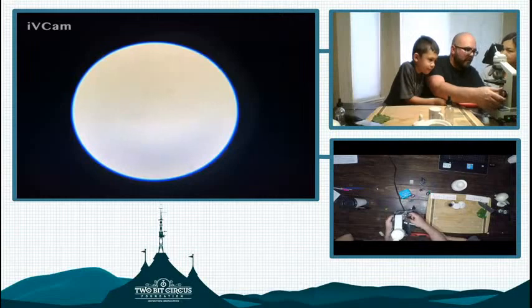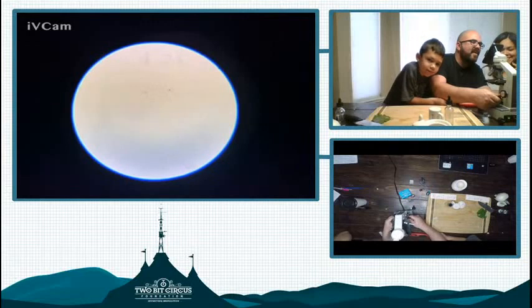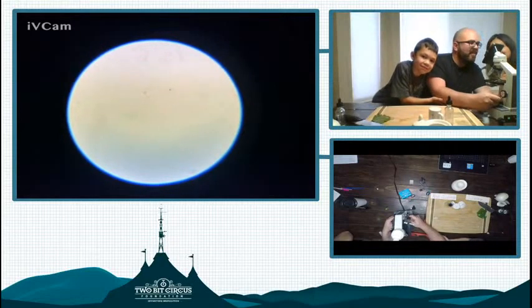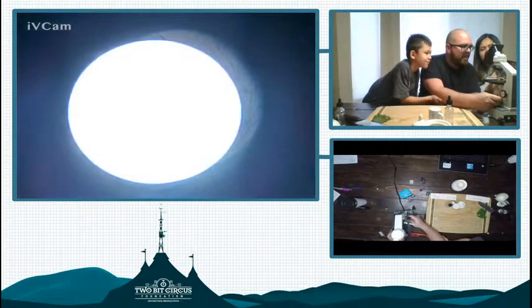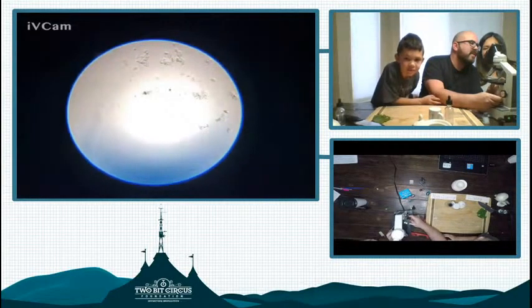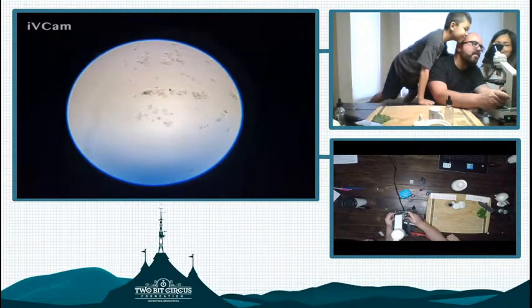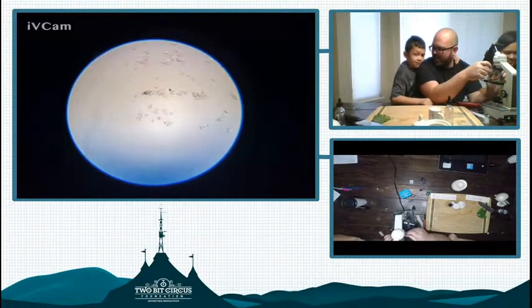You gotta put it way higher. It doesn't go higher. Oh, that's it? That's why. The focus is all out because you're messing with the fine focus. Alright, so I'm starting to be able to see the structure of some stuff, but it is still hard to tell what it is. Maybe less light through here? Oh, there we go. Look. Are those cells? So I see yucky stuff that came out of Robert's mouth here. And maybe they're cells. We want to take a closer look in there, huh?